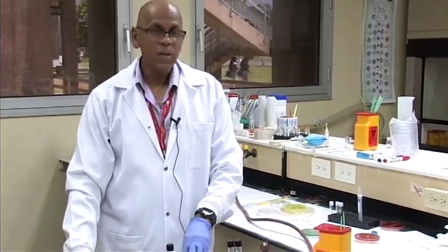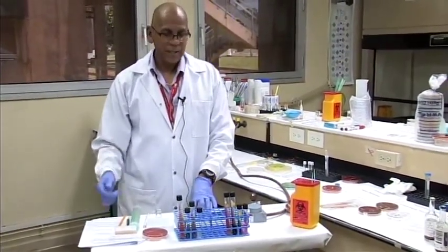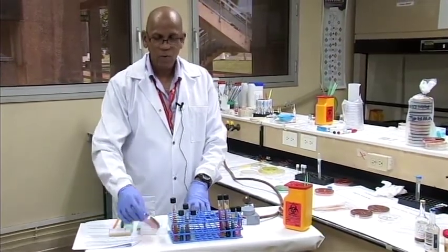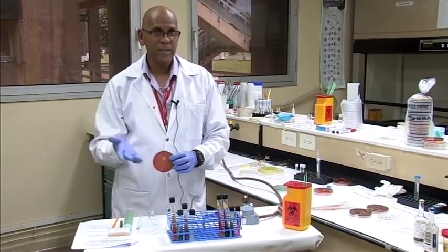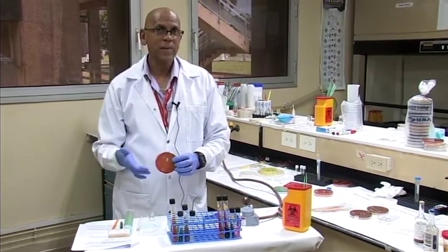So now we're going to speak about inoculation for biochemical tests, or biochemical tubes. As part of the investigation, having done your culture and come up with growth on your plate of a suspected pathogen, you now have to try to identify this bacteria. This is done by doing several things, for example the gram stain, maybe preliminary tests like catalase, coagulase, and so on.